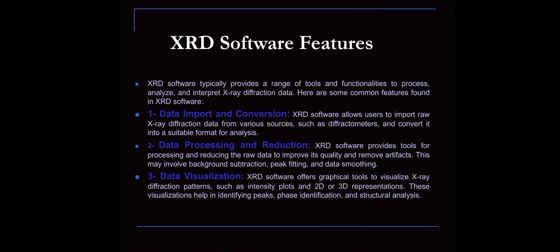XRD software typically provides a range of tools and functionalities to process, analyze, and interpret X-ray diffraction data. Here are some common features found in XRD software. One, data import and conversion. XRD software allows the user to import raw X-ray diffraction data from various sources such as diffractometers and convert it into a suitable format for analysis.